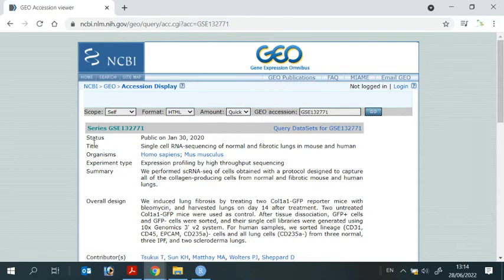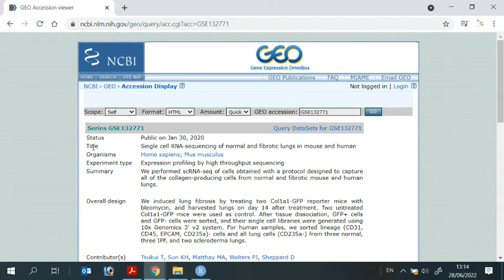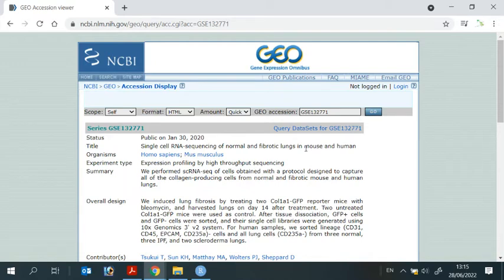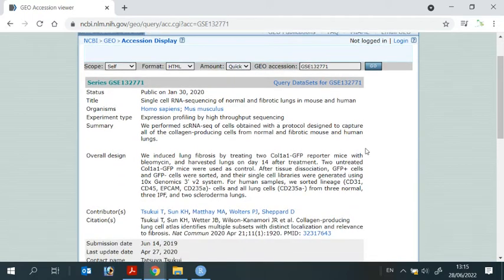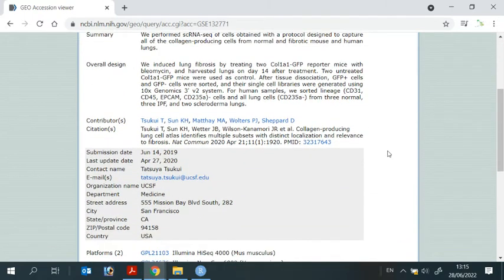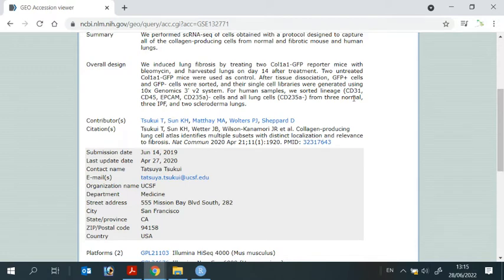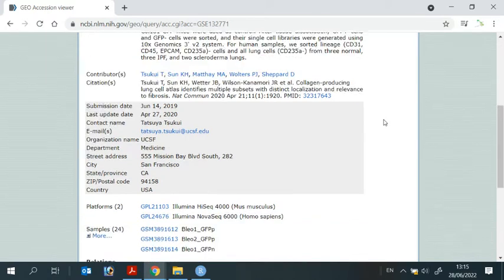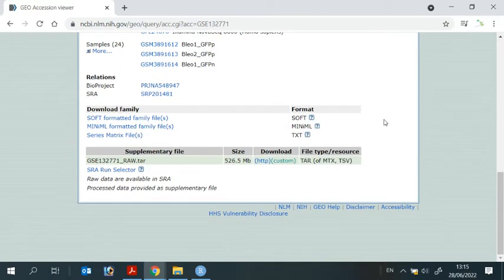You can see the data is available from January 2020. From the title description, we know that the data set contains single cell RNA sequencing data for lung tissue from both mouse and human. For the demonstration, I'm going to use the data set for normal human lung tissue. We can scroll down to find the data. Here it is.